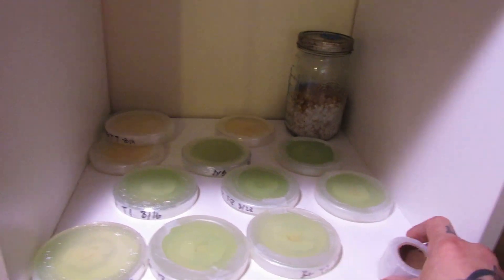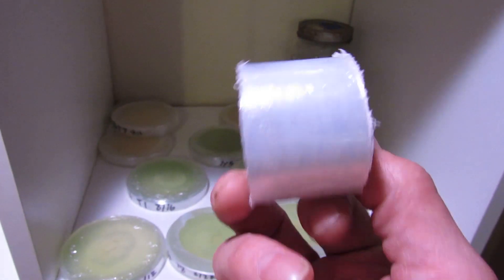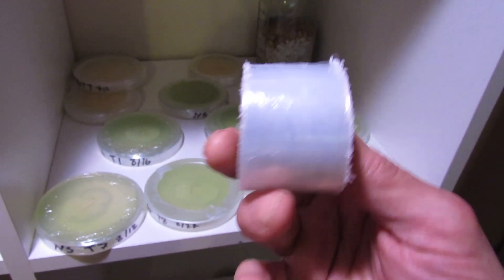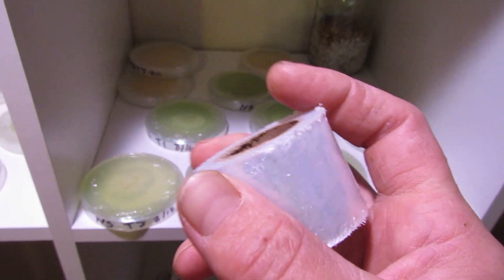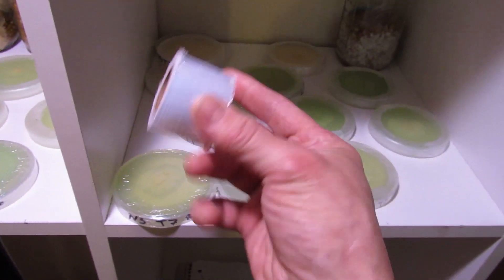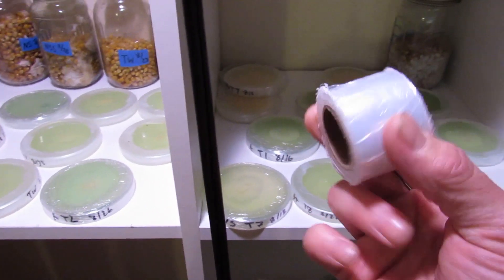Number three: you can use glad cling wrap instead of parafilm. Parafilm is a little more expensive, but you can take a roll of glad cling wrap, take a hacksaw and cut it into sections a little bigger than an inch. Just make sure you take a really sharp razor blade and cut off all the little jagged edges on the sides, because it makes unrolling it and wrapping your plates a pain.